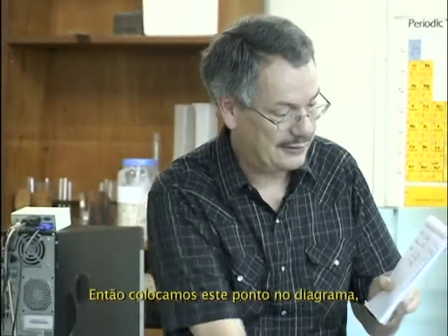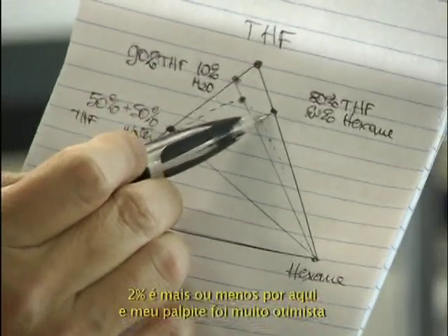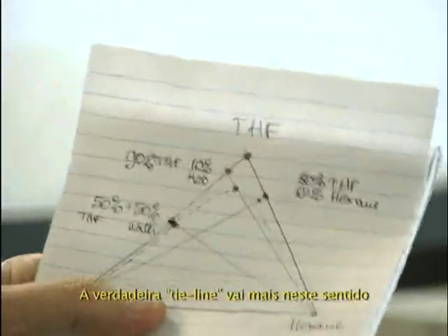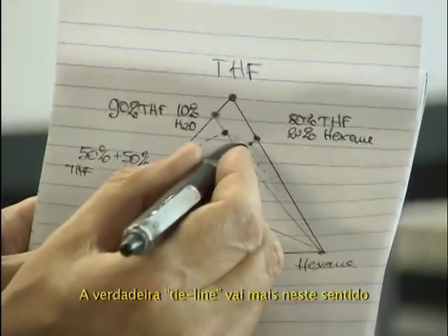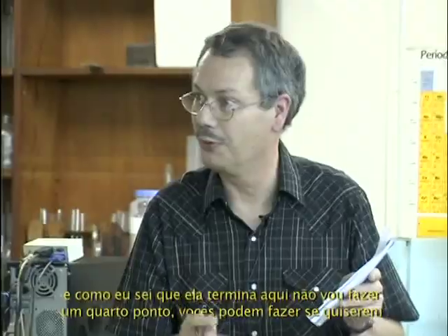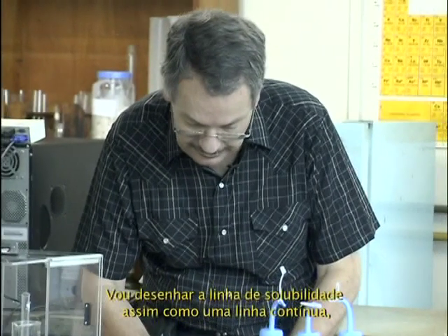So we put this on the phase diagram. 2%, it's approximately here. So my guess was too optimistic. The real tie line goes more this way. And since I know it's finishing there, I will not make a fourth one. You're welcome to do it if you want. I will draw the binodal curve this way with a continuous line.